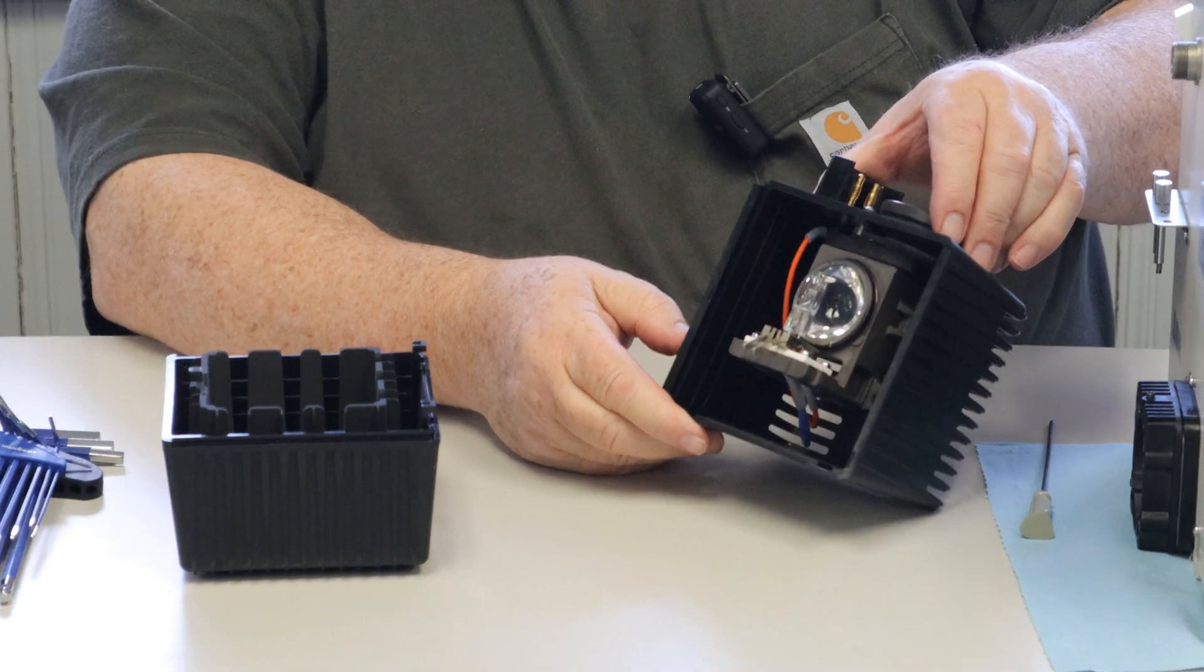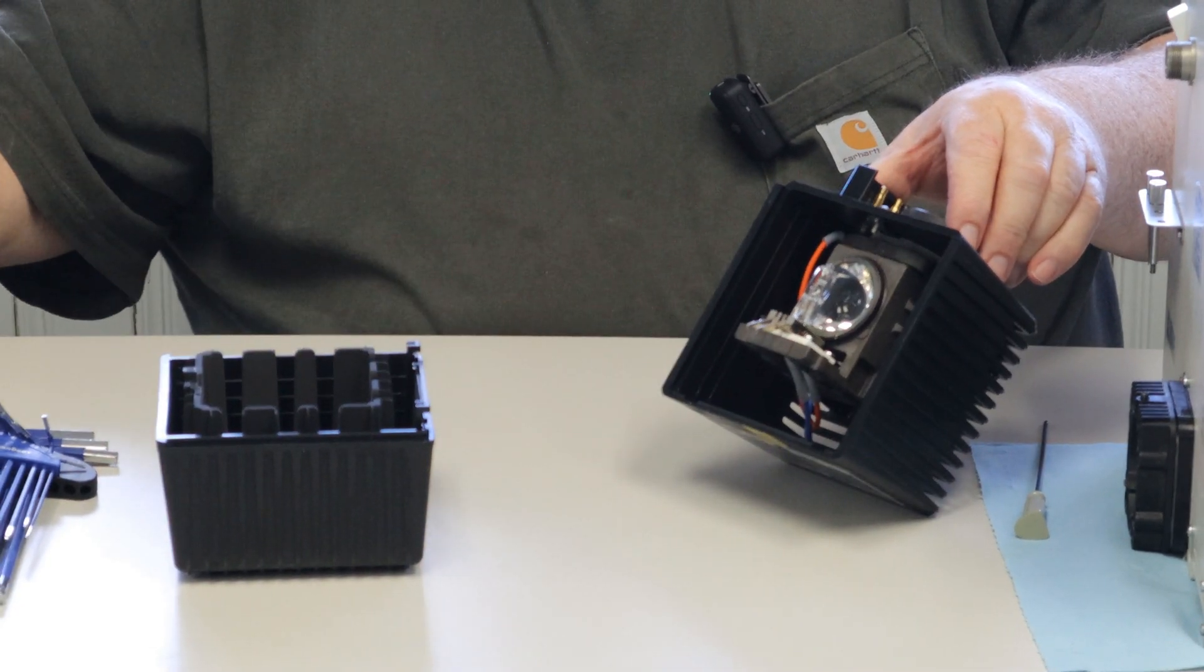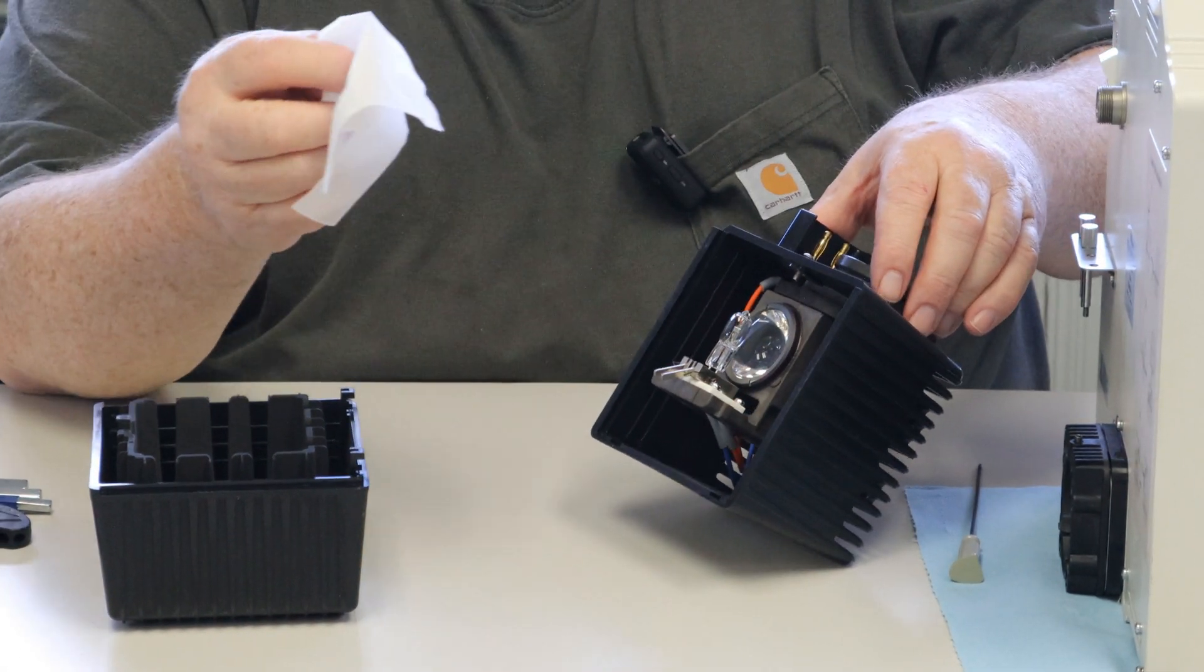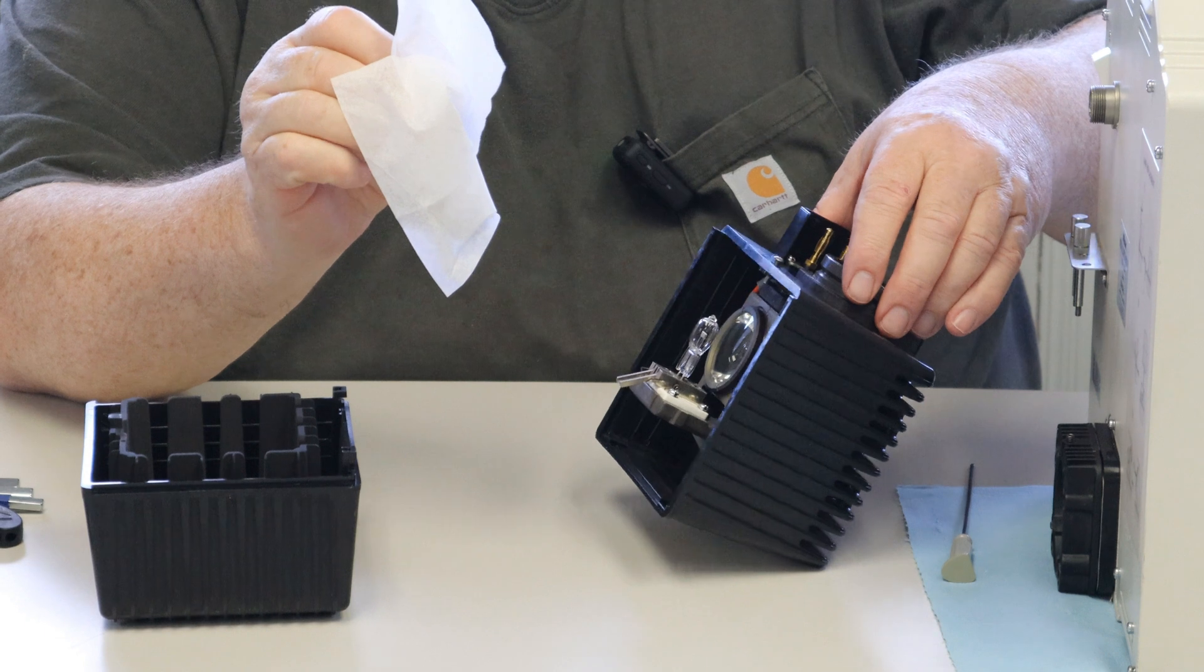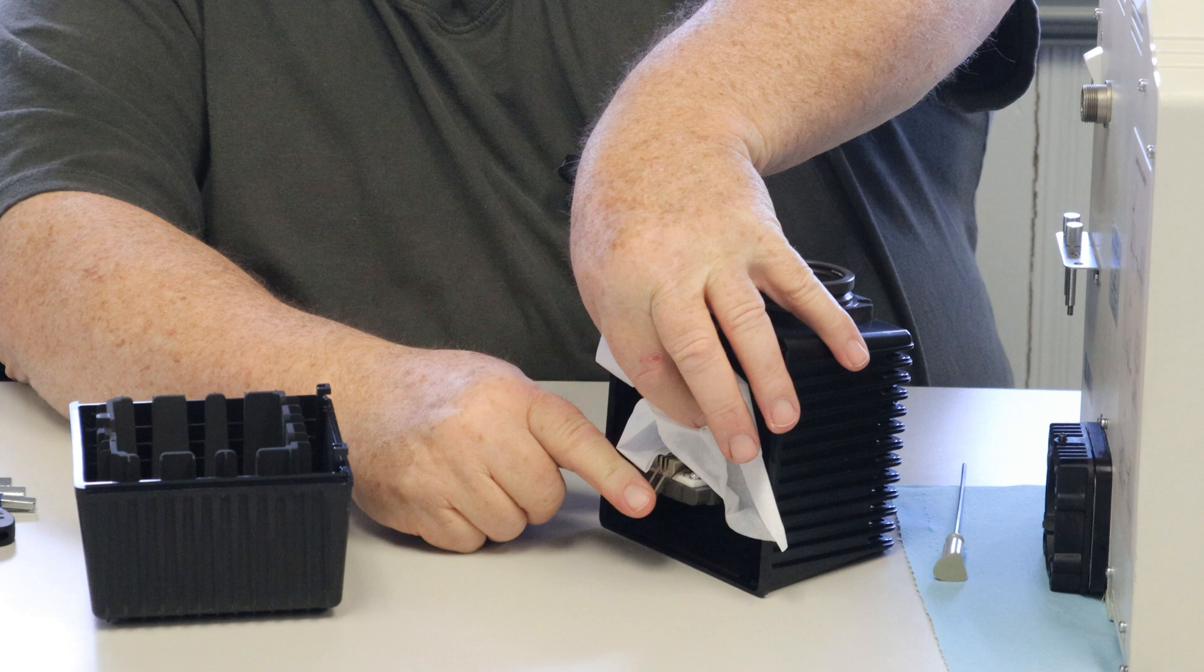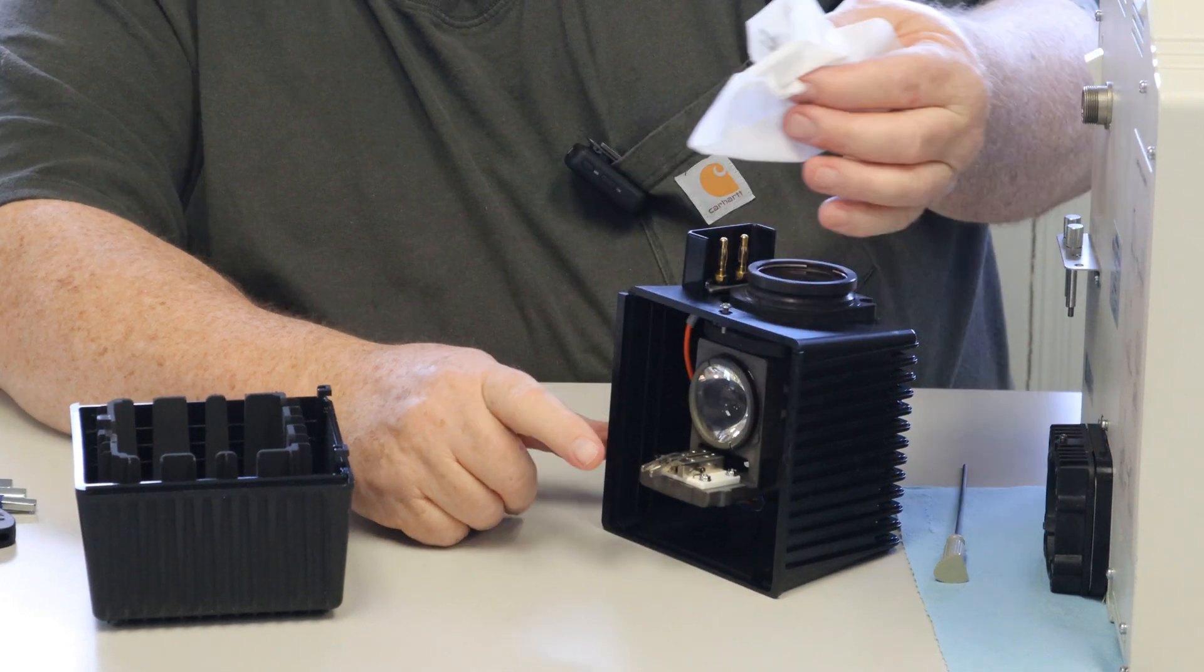Your bulb comes out much similar way than other ones. Again, use a tissue so you do not get your fingerprints on the globe of the lamp bulb. Put your two prongs down and the bulb comes out very easily.